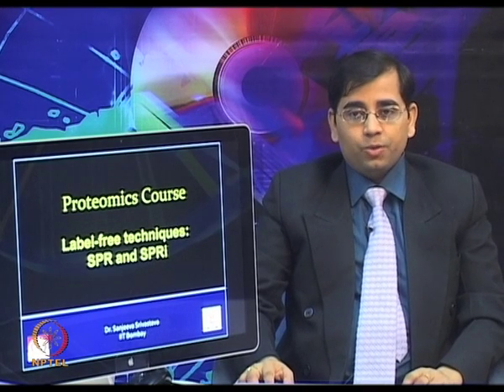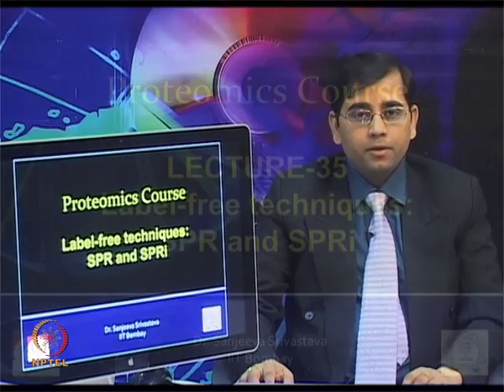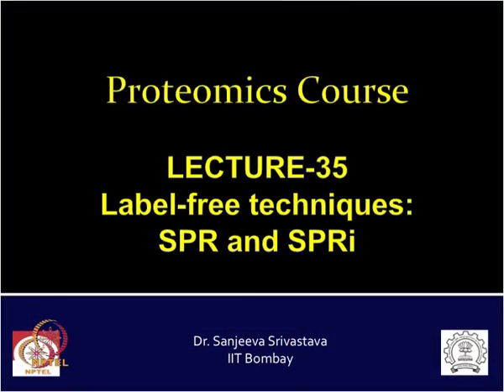Welcome to the proteomics course. In today's lecture, we will talk about label-free techniques such as SPR and SPRi.